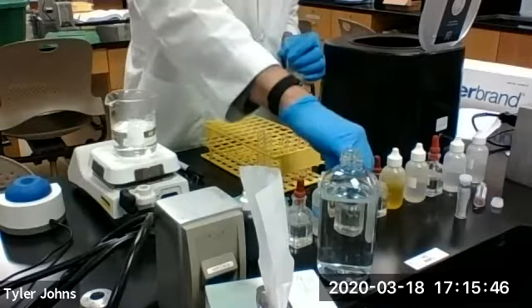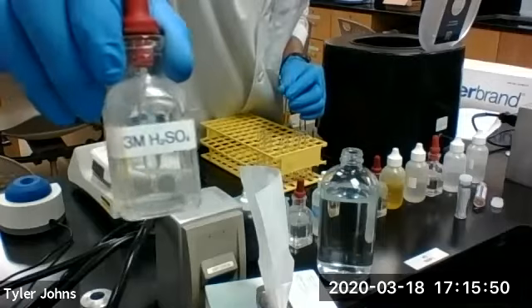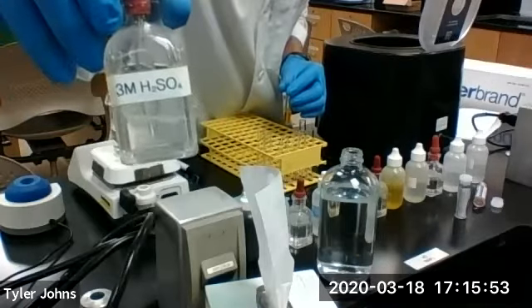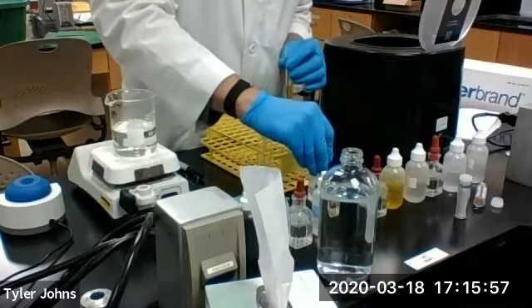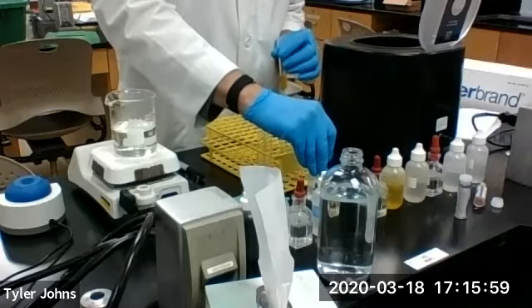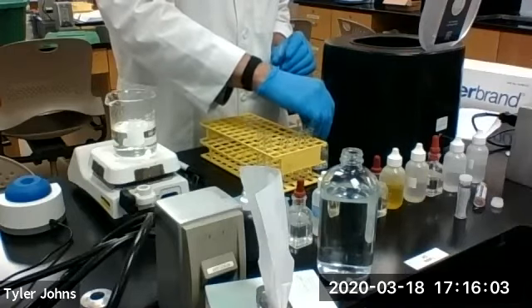We're now going to add 3 molar sulfuric acid. And if the barium ion is present, we should get a white precipitate of barium sulfate upon the addition of 3 molar sulfuric acid.